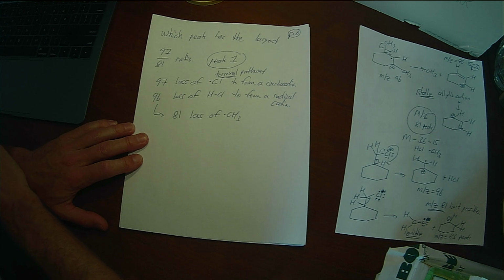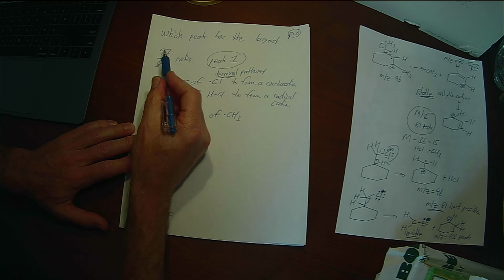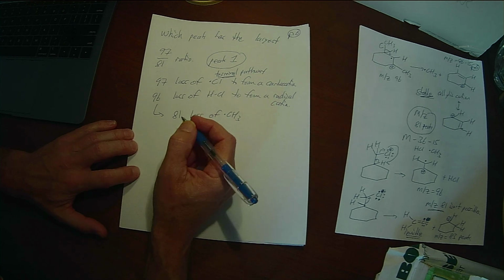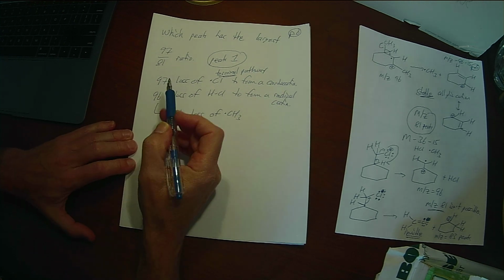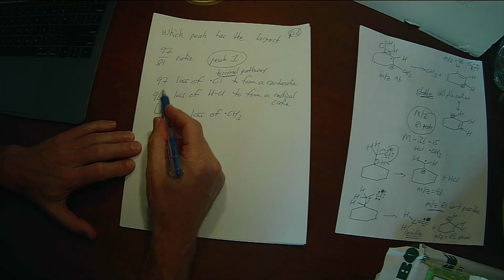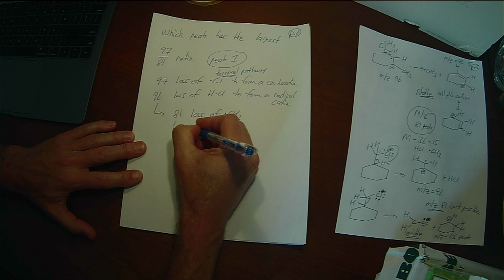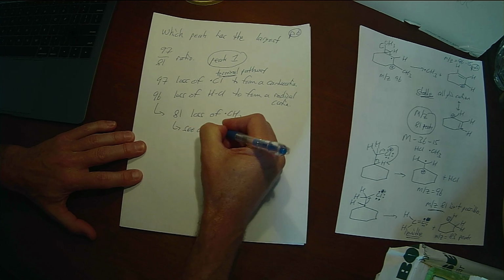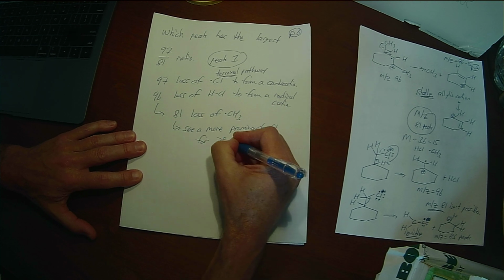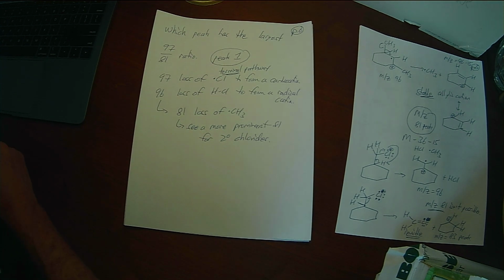I think when I was emailing with you yesterday, Emma, I was telling you should look at the 97/96 ratio, and that's not what I meant. It's the 97/81 ratio that allows you to distinguish between the tertiary and the secondary. Because both tertiary and secondary can lose HCl to form 96, but the secondary is going to generate a lot more of the 96 over the 97, which means the secondary will generate a lot more 81, right? We should see a more prominent 81 peak for secondary chlorides. Which one had the lowest boiling point?